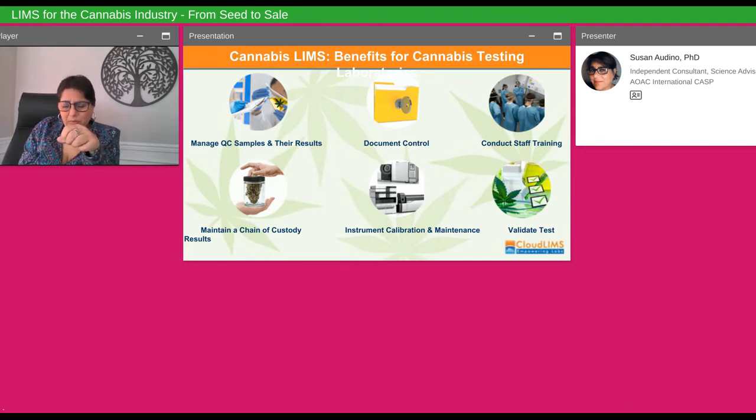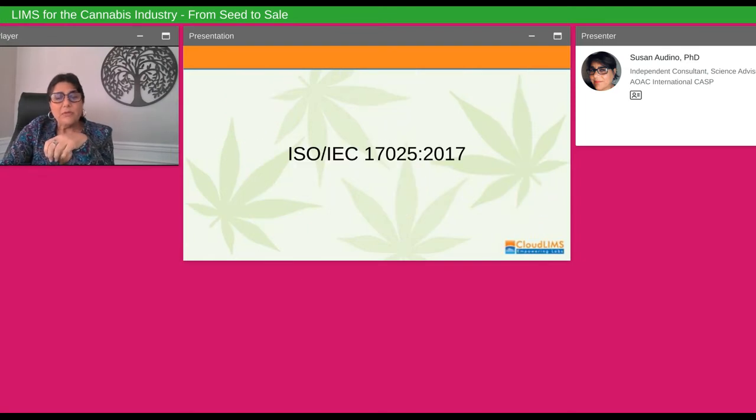So that validation process can be very complex, and it can be somewhat circuitous at times, quite frankly. There's a lot that goes on with that, and a lot of times laboratories are encumbered by hiring extra personnel to check test results and validating the individual results before they go out. So there's a lot that goes into running a laboratory and generating a test result. And LIMS here can certainly help the laboratory in any number of these places and on any number of levels.